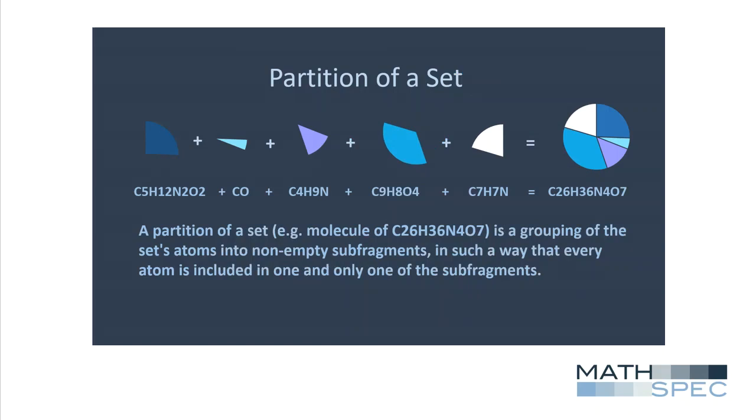Because mass to formula is usually a one-to-many relationship, often multiple molecular formulas for the whole molecule are possible. The last thing the Excel add-in does is check to try to assign the subfragments in space, and that's based on using logic tables.